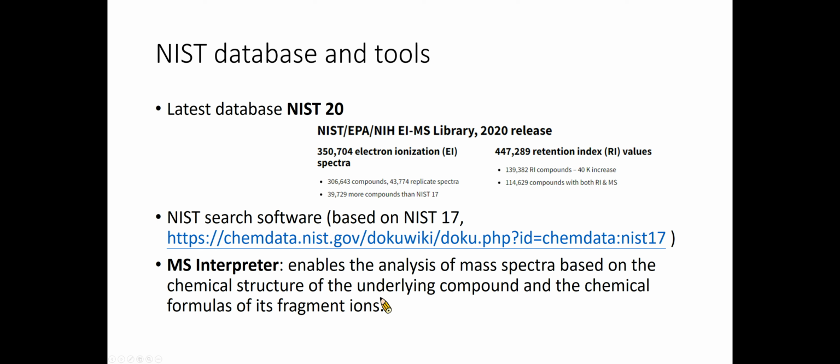The NIST mass spectral database is widely used by researchers, industry, chemists, and government agencies for a variety of purposes, including chemical analysis, quality control, and environmental monitoring. It is recognized for its high quality, accuracy, and reliability, and is considered a valuable source for scientists and technicians in the field of mass spectrometry.